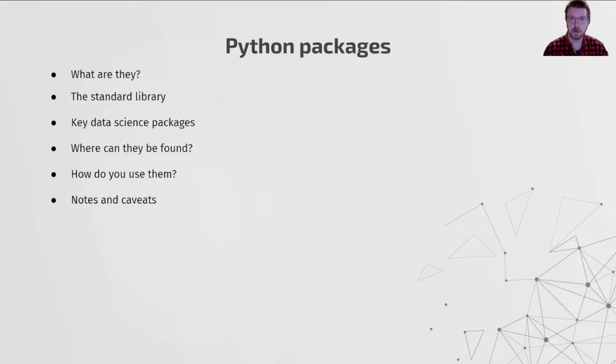Now let's turn our attention to Python packages. As I mentioned during the overview, packages are a way to extend the functionality of Python beyond its built-in types and functions. There are literally thousands of packages that allow you to do almost anything with Python. If you've followed the Python for Everybody lessons during weeks 1 and 2, you've already used a few packages, for example, the regular expressions package. Using this package provides powerful string parsing features that are not part of the Python language itself.